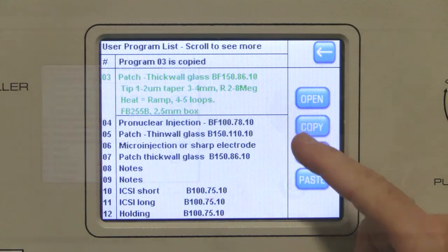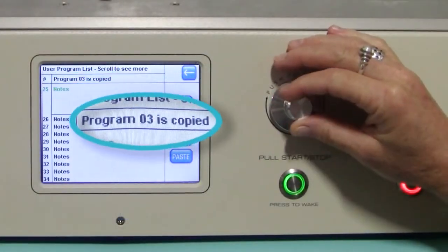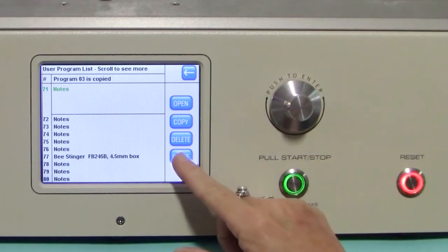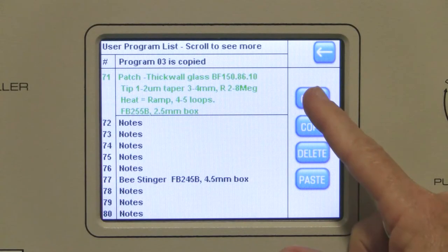Press the copy button. The status line in the top part of the screen reports that program 3 has been copied. Now use the knob on the front panel to navigate to program 71, then hit the paste button and open the new program.